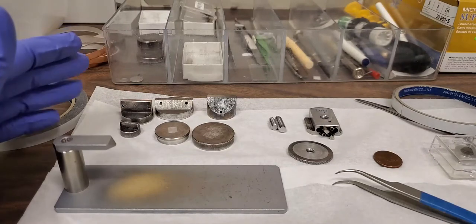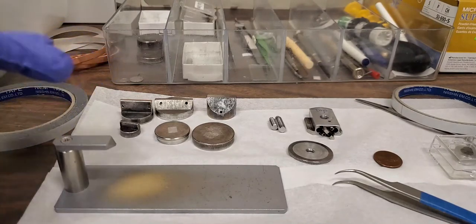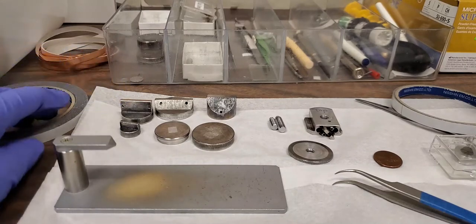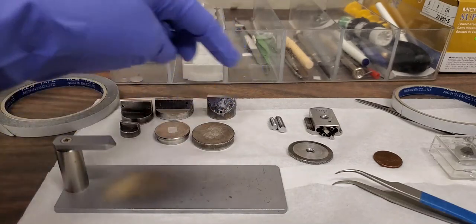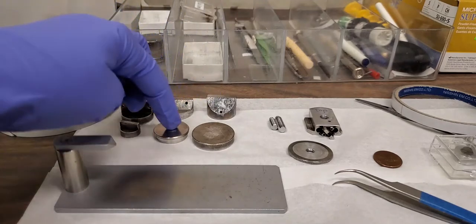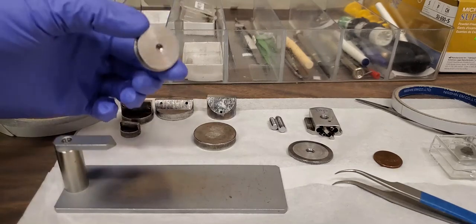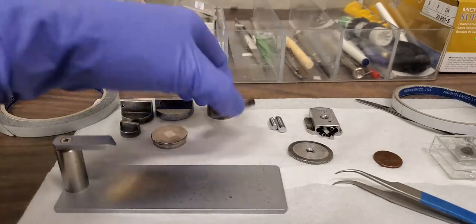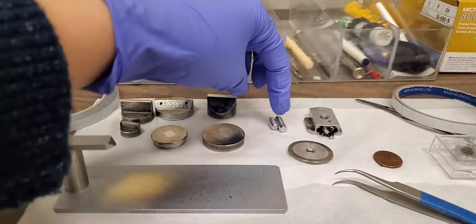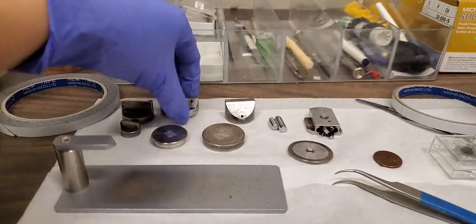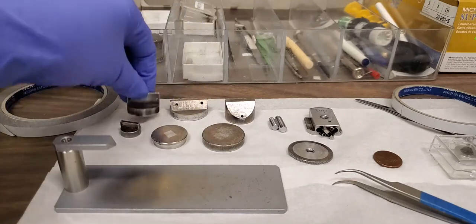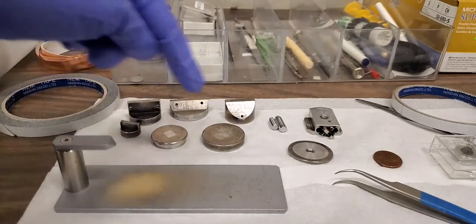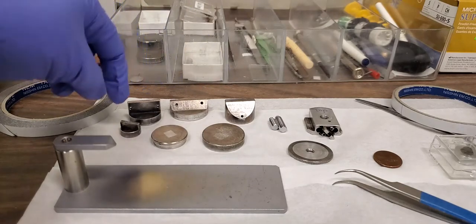Here we have the different types of sample holders that you can use for the Hitachi 4800 at MRL. You can see there's a few different sizes used for different purposes. They have this hole on the bottom which allows it to screw into the short or the long screw. You have to make sure that it has that feature. Now what are these for? Different size samples and also different orientations of the sample.